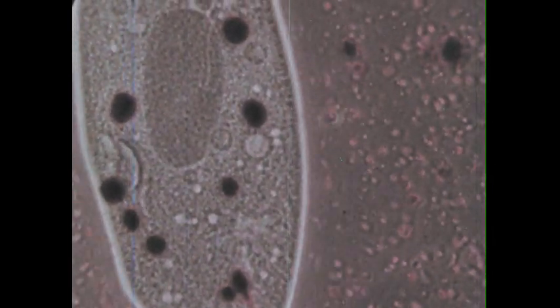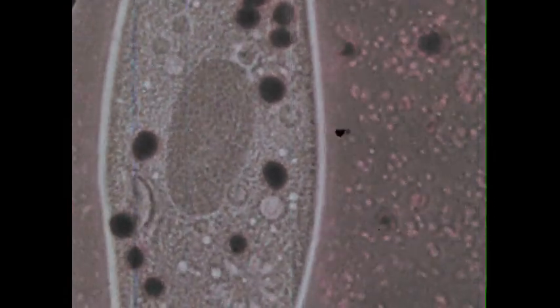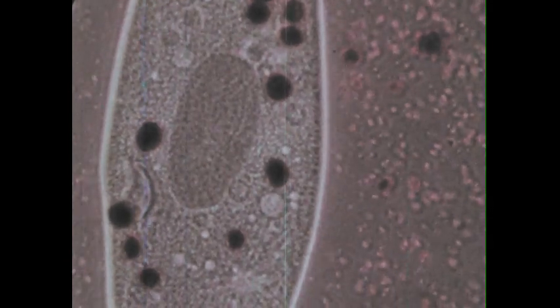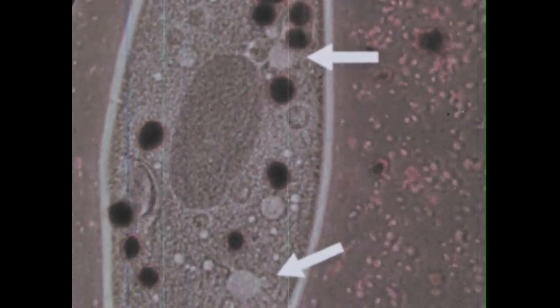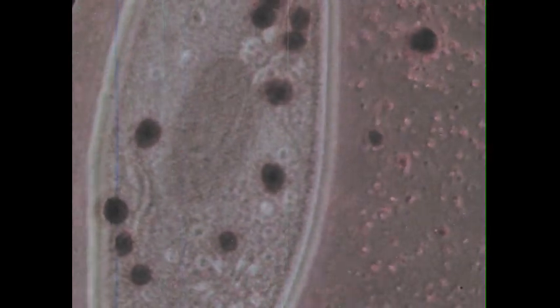What is this thing that appears and disappears, that expands and contracts? It's called the contractile vacuole. In Paramecium, there are two of them. What do you think they do for the cell?